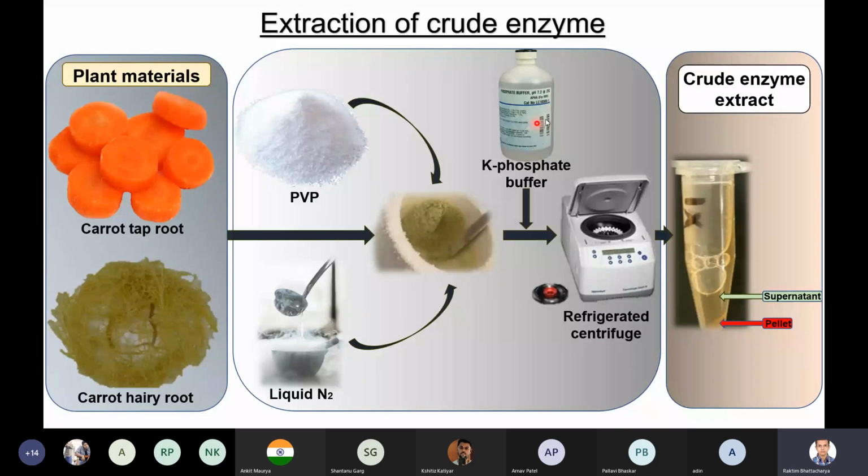Potassium phosphate buffer of pH 7.2 at room temperature of 25 degrees will ensure that the enzyme will not degrade. Because if we put it in distilled water or any type of water, the enzymes will degrade. The pH of distilled water is 6.6, which is lower than the cellular pH, so that will degrade the enzyme.